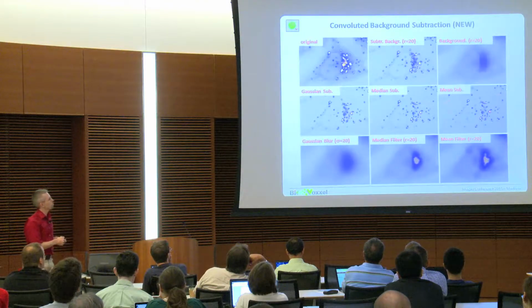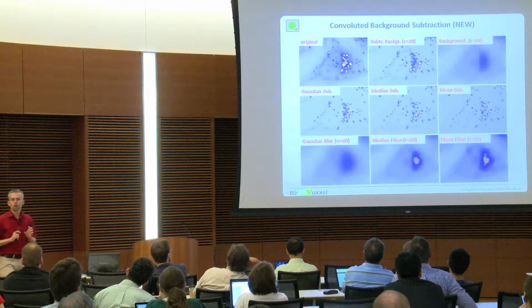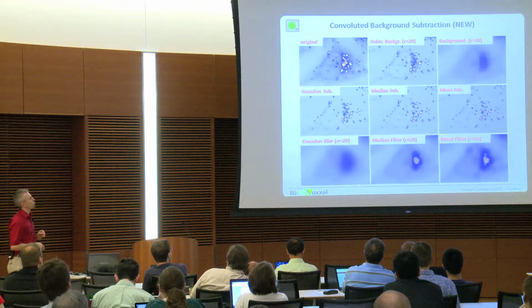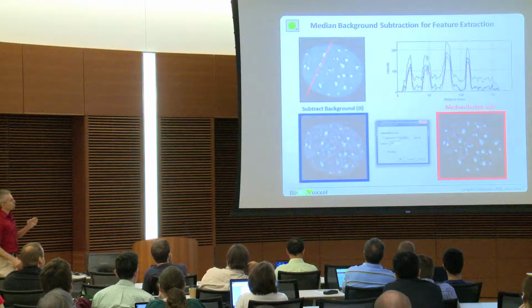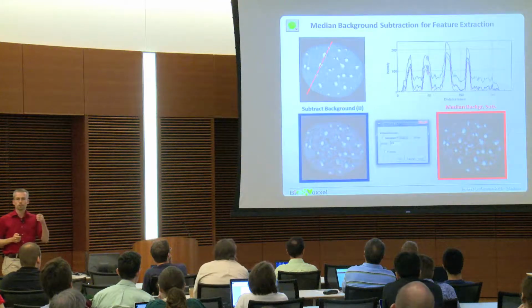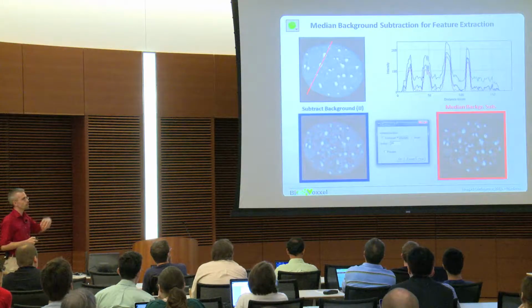Nevertheless, if we want to work out those spots from the image later on by segmentation, we might be able to separate them better or have them individually better when we try one of those functions. Here is again a comparison. Basically, these would be the spots, while what is in between is real staining. In that moment when I want to extract the spots, for me that is background.